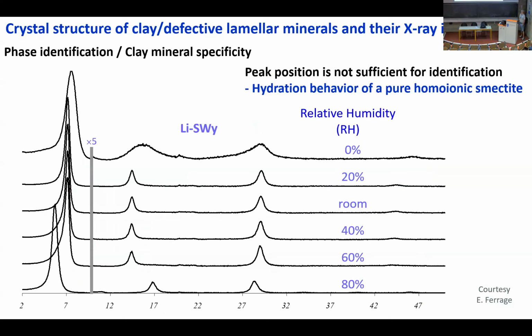Another thing you may want to do related to that: here I have the same smectite as before, only with lithium in the interlayer, recorded at different relative humidities. Again, think that your identification is based on peak position.